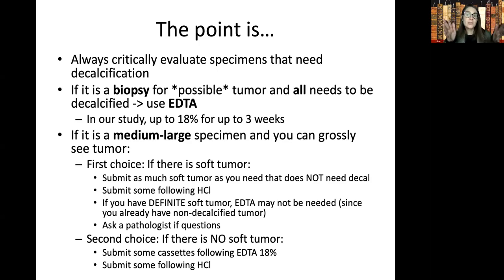But then these patients, even at smaller institutions, get referred to tertiary care institutions, and then the molecular testing is requested. And then if the tumor is all decalcified, you can't do it, right? So the reason is for personalized medicine. The physicians are trying to find targeted mutations that they can target with very specific chemotherapies. And so this is becoming the wave of the future. So always keep it in mind.